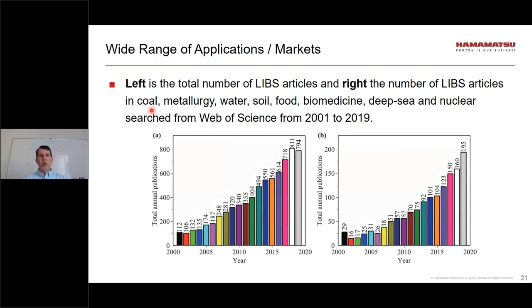Applications such as coal, metals, water, soil, food, biomedicine, all of these different applications, and how rapidly the publications for LIBS technology are growing these days.